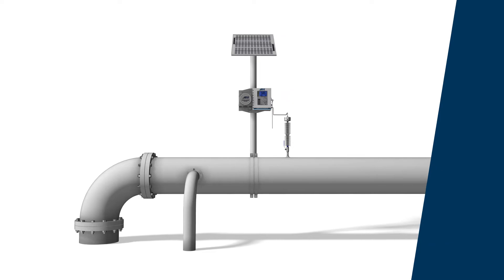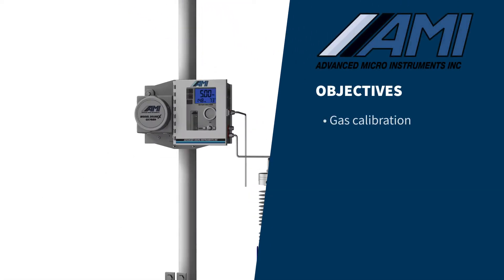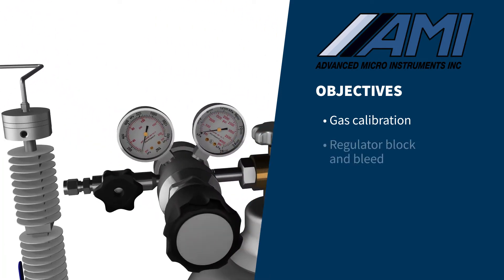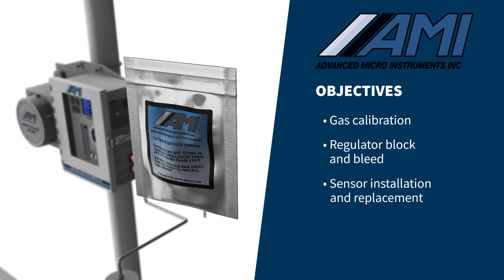In this video, we will instruct you on how to perform a fast, simple, and accurate gas calibration for AMI's trace or PPM oxygen analyzers using a certified cylinder of calibration gas. Also, we will show you how to install a new oxygen sensor in the analyzer.